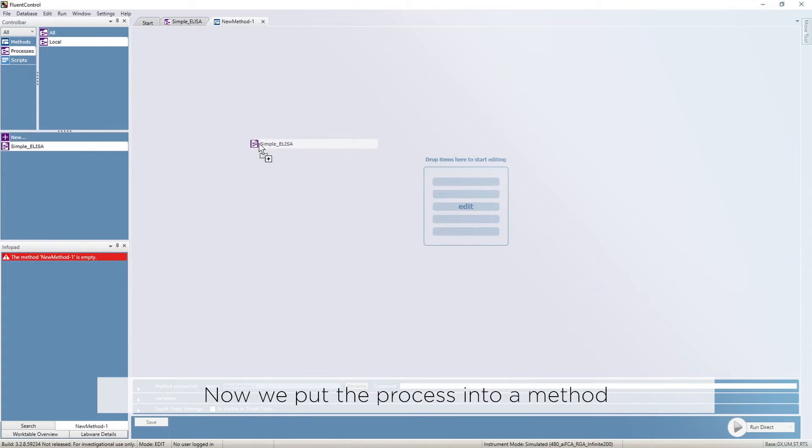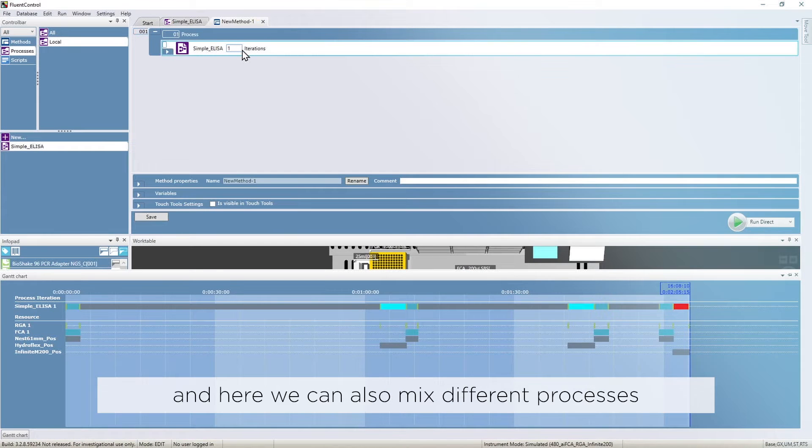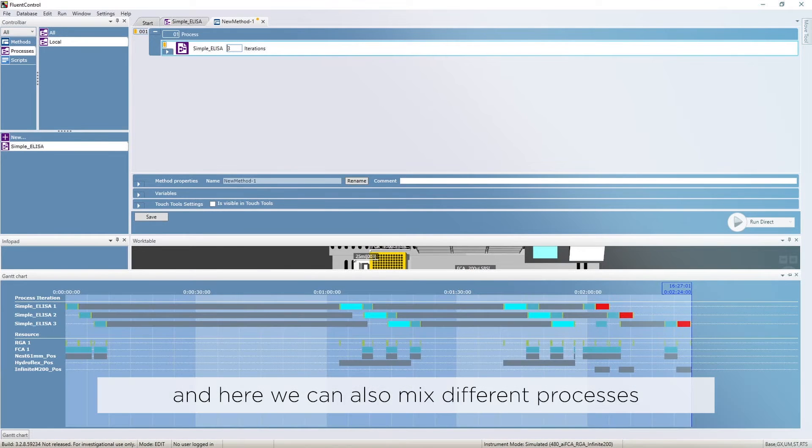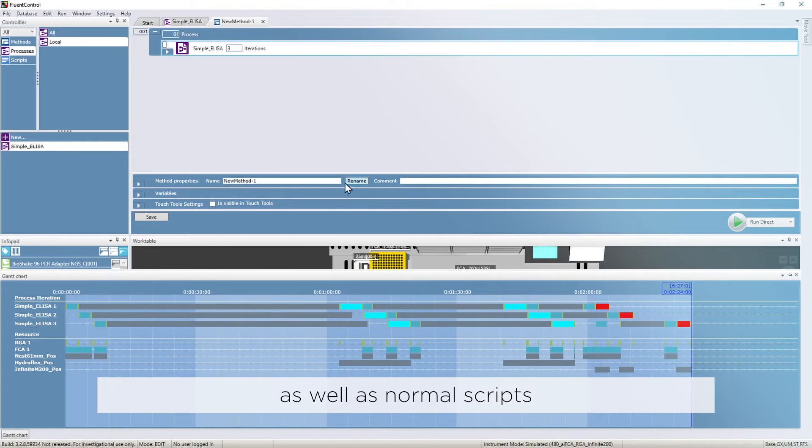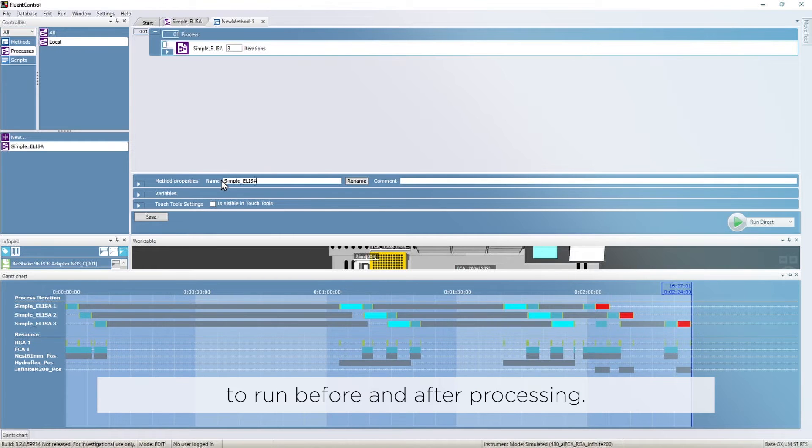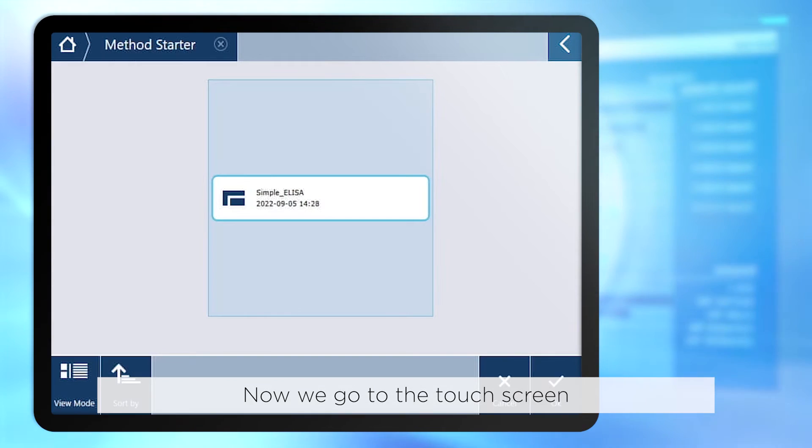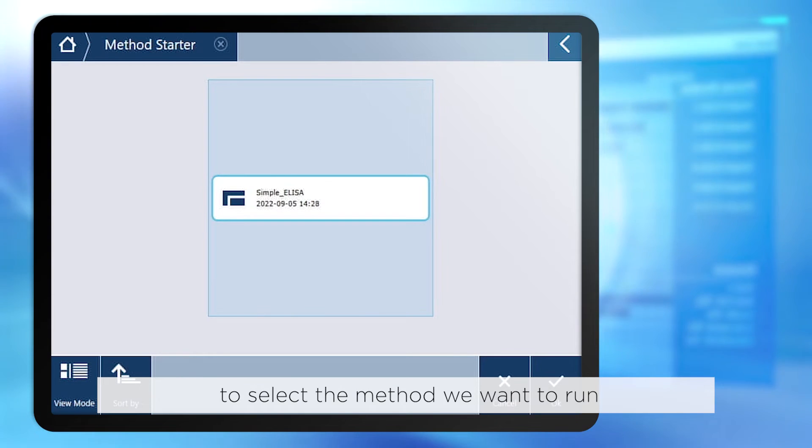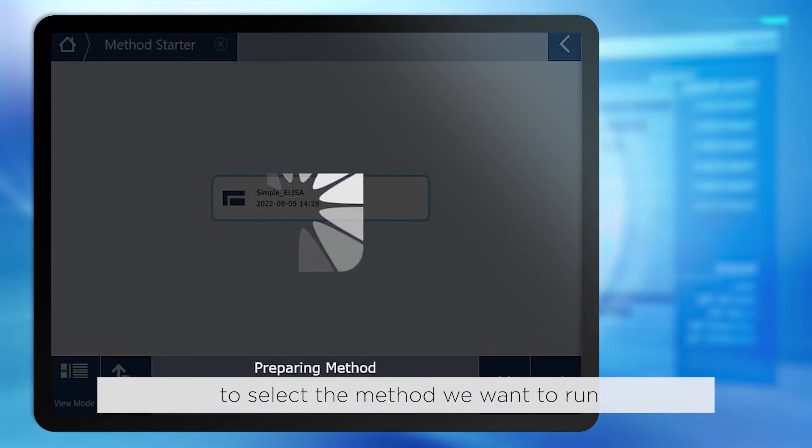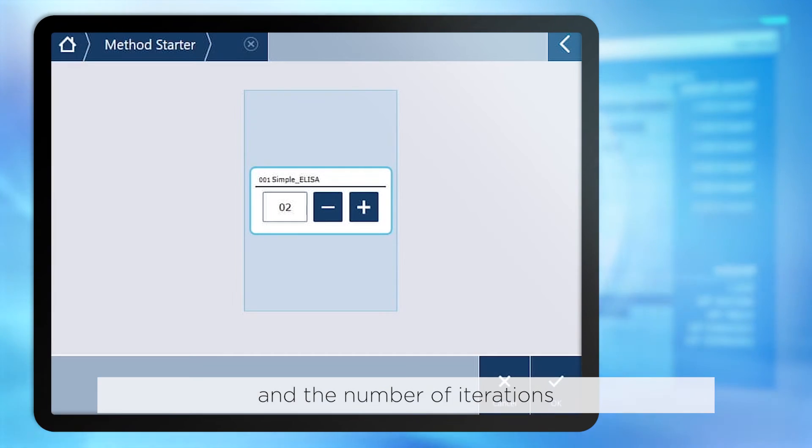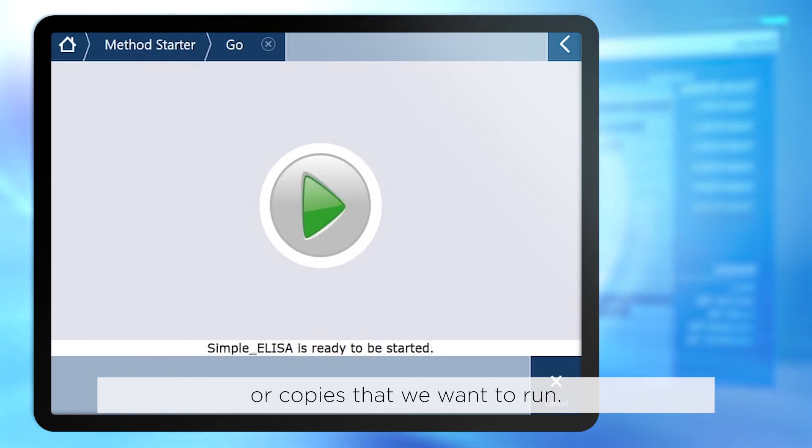Now we put the process into a method and here we can also mix different processes as well as normal scripts to run before and after processing. Now we go to the touchscreen to select the method we want to run and the number of iterations or copies that we want to run.